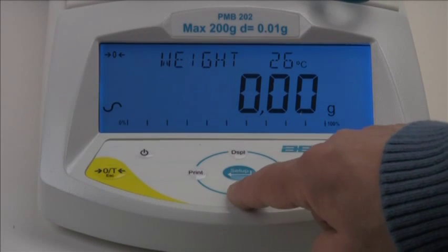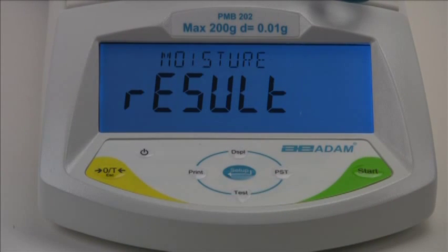Press the test down arrow key to show results with the current setting: moisture, solid, ATRO moisture, or ATRO solid. Using the display up arrow key and test down arrow key, you can step through the available types of test results.